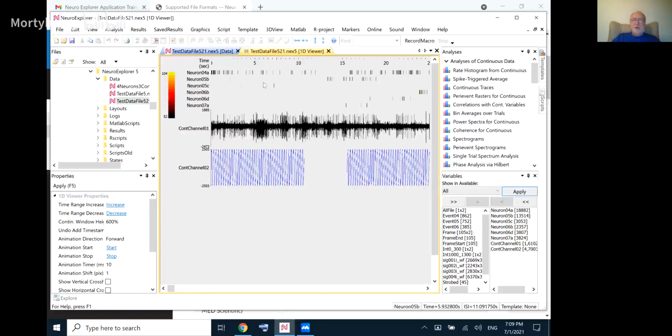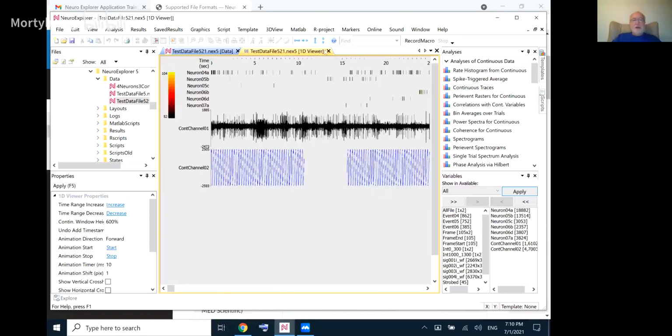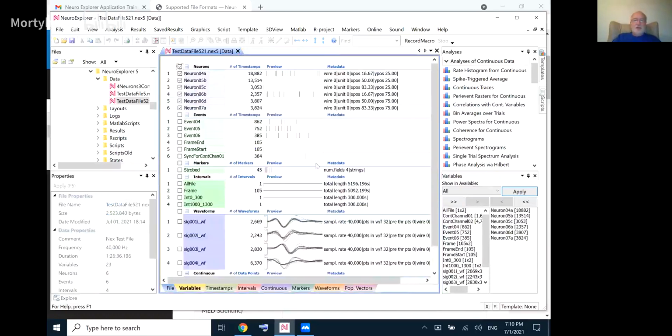For example, if you have behavioral experiments and you know that something happened, or you have an artifact, you can mark these artifacts here. So I'll probably, if you're interested, I can show you how to do this. Is it interesting, or will we need to go over to some kind of more generic stuff? Okay, so we will not do this, but the main idea is to use right click, then you can see all kinds of options. So that's how we view the data.